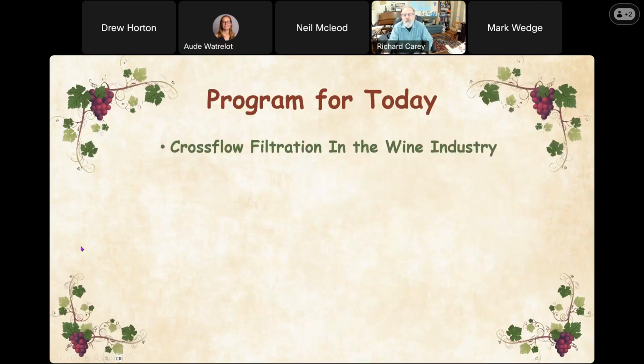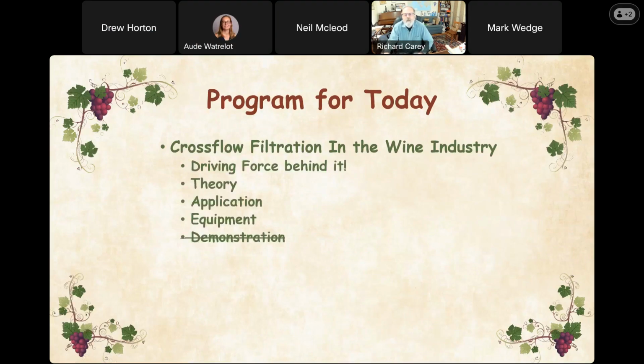So here we go. Crossflow filtration in the wine industry is a driving force. We're going to talk about the theory, the application, and the equipment. I had thought I was going to have a demonstration of how a small crossflow filter works, but time got away from me and we aren't going to have that today.